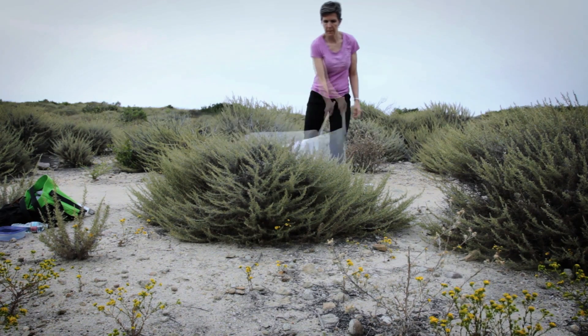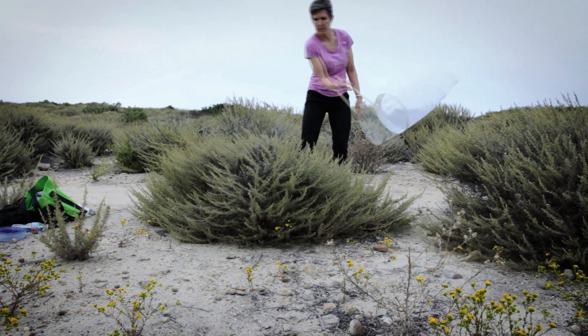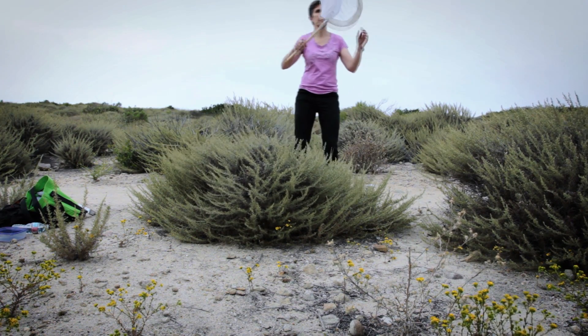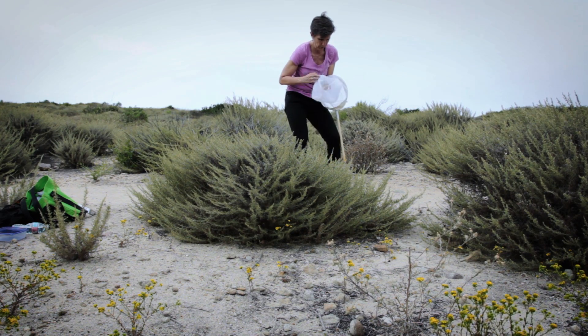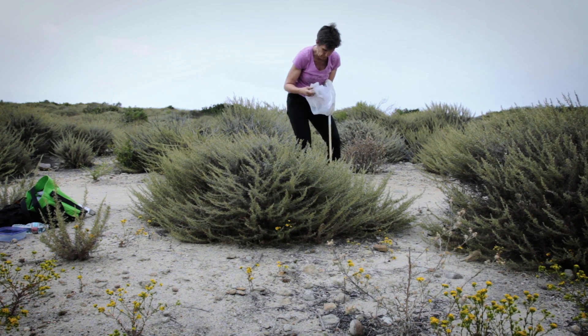Here are some ideas for collecting insects. Sweep netting: sweep any soft vegetation with your insect net. Lots of small insects will get caught. It is a bit tricky to get them to your kill jar, so just do the best that you can.